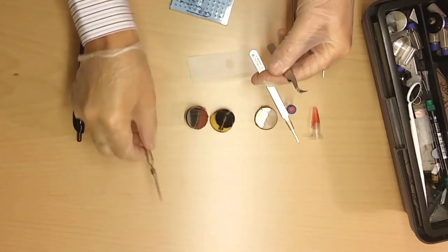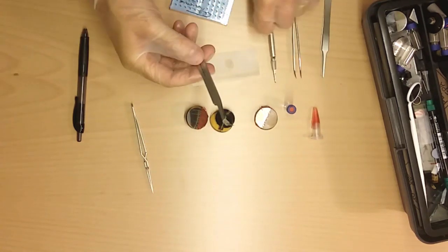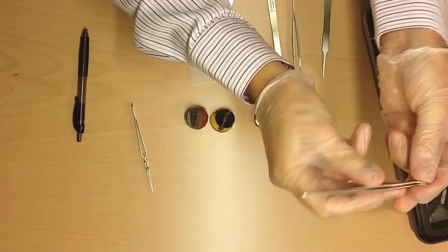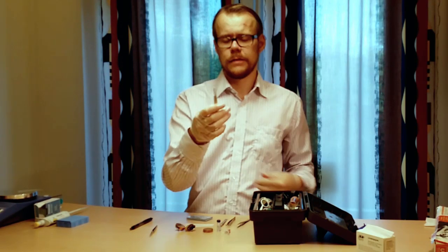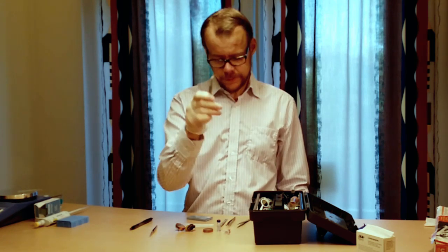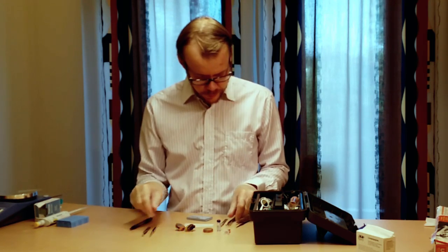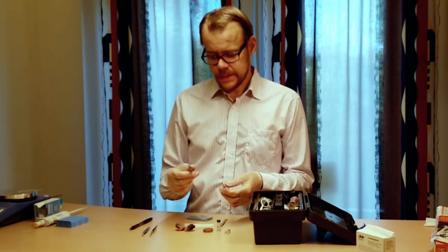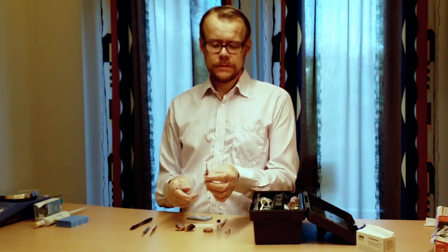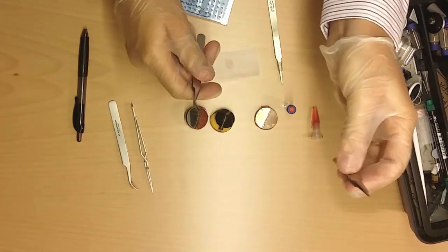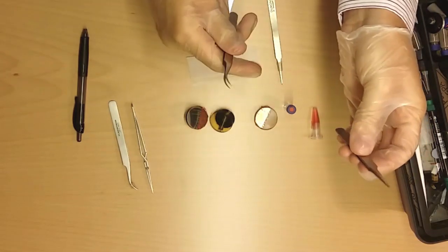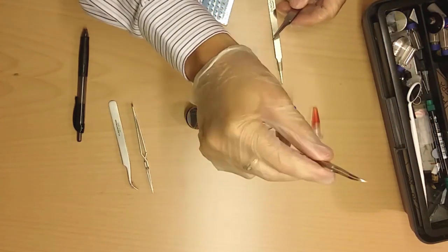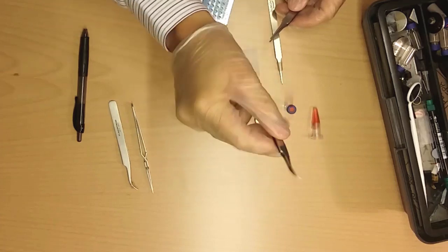You can also make these ones by yourself. By taking a regular tweezers like this and put on some rubber stuff on top here. That way it is fixated. Very handy. And they are also nice to have different sizes and different shapes of the tweezers. For example this one is a straight and broad, broaded tip tweezers. This is more of a general use. And this is a bent and very sharp tip. This is very handy for TEM grids.